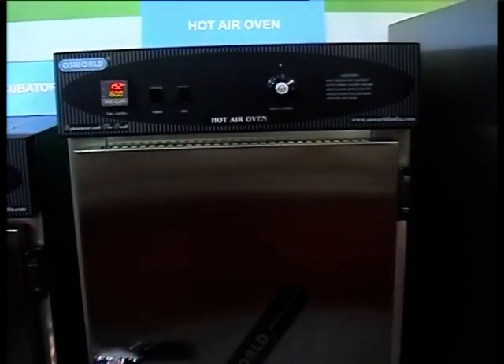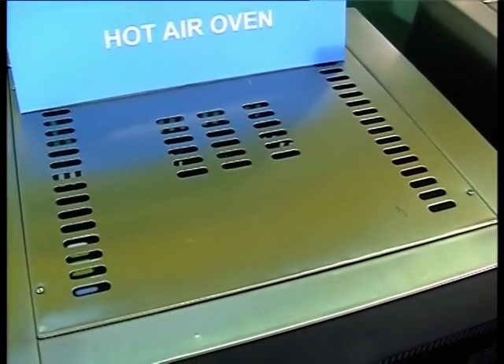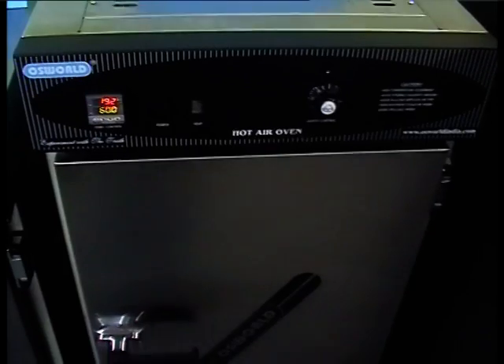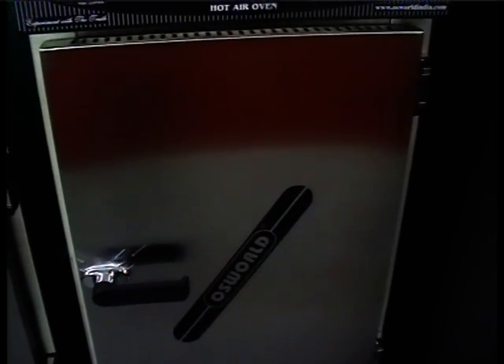The Osworld Hot Air Oven has a double wall design which provides for precise temperature control, durability and excellent uniformity. This model has an outer SS304 grade matte finish and an inner stainless steel mirror finish. The oven has a silicone door gasket which prevents heat loss and also prevents the escape of harmful fumes.